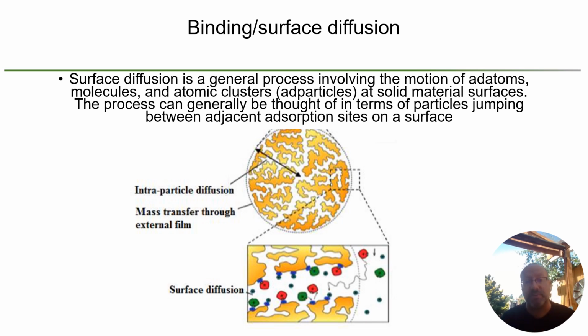That's basically it. So we start out with loading our analyte onto the column. We get axial dispersion. It's going to go down through the column and then out. That's axial dispersion. Next, we're going to get the boundary layer. The boundary layer is the bead and the analyte, the viscous material that the analyte's becoming. It's becoming more concentrated around the chromatography bead itself. The next phase in fluid dynamics in liquid chromatography is we're going to get pore diffusion, where the analyte starts to move into the actual pores of the bead.